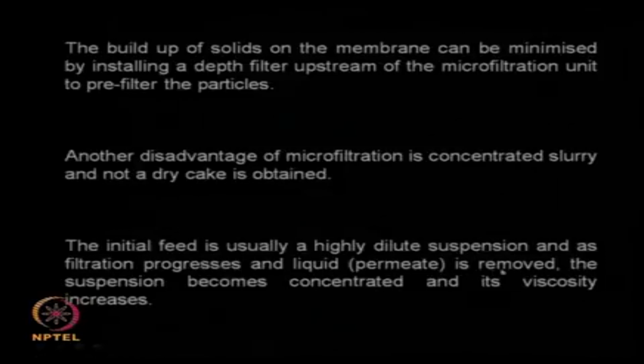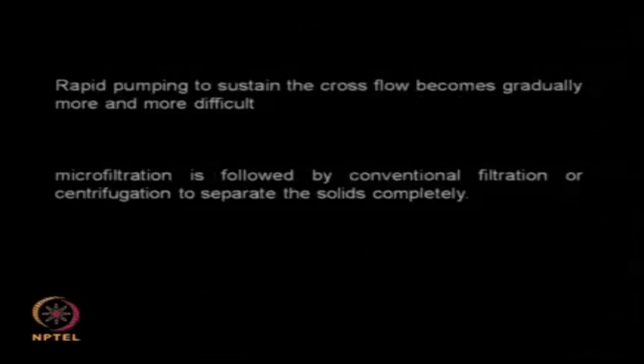As the filtration takes place, you are also going to have an increase in viscosity. That is another problem in microfiltration. So the viscosity of the slurry as the solvent is removed is going to increase, so it will retard your permeation or membrane filtration process. So these are some of the disadvantages of this type of filtration, microfiltration.